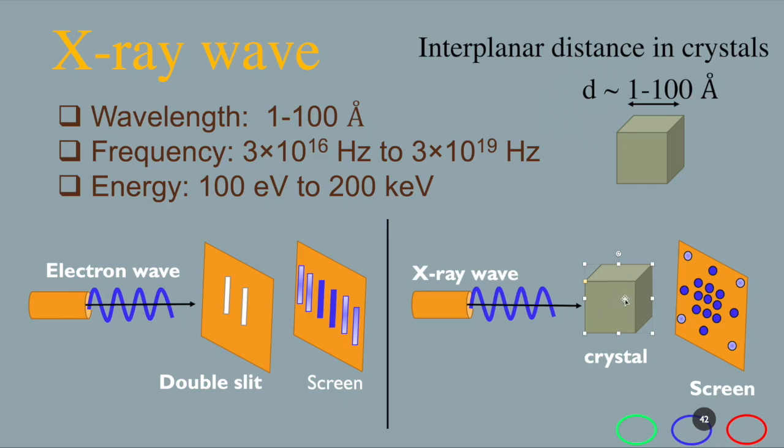which are indicative of the internal structure of the crystal, just as the pattern on the screen here depends on the types of the slits, the distance between the slits, and the number of slits. It affects everything in the diffraction pattern here. Similarly, the type of crystal structure and type of plane should affect the diffraction pattern on this screen in a predictable way.